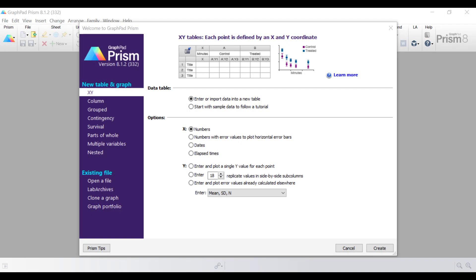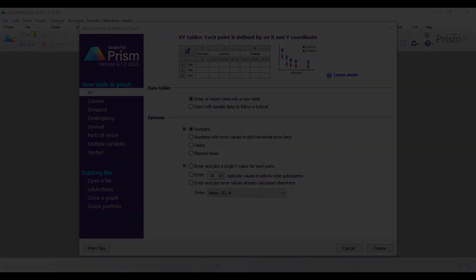Hello, my name is Dr. Stephen Bradburn from TopTipBio.com. In this video tutorial, I'm going to show you how to use GraphPad Prism to create a heatmap and to understand how to interpret the output.